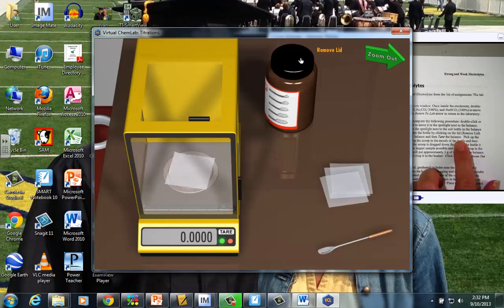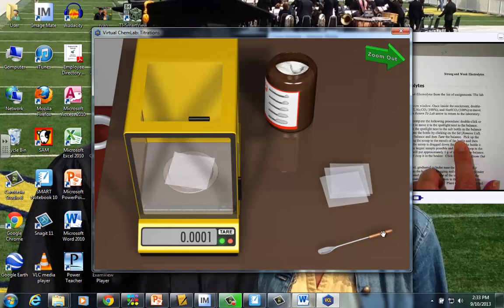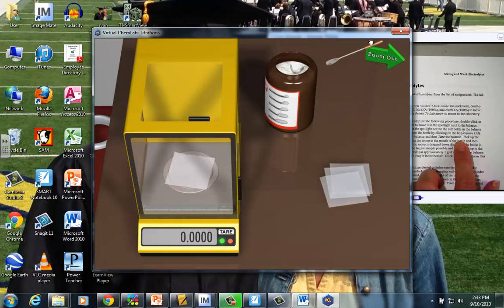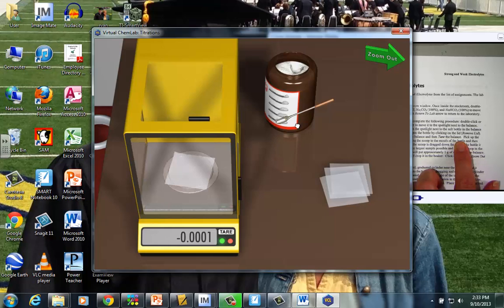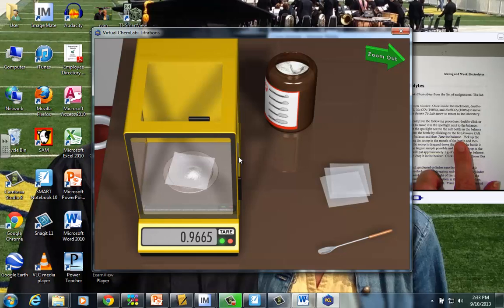If I put the cursor up here, I can remove the lid. And this might be the trickiest part, is grabbing the scoop, and just bringing it down the front of the jar to gather the contents there. Alrighty, so here I've got about a gram, and I just click and drag and let it go. So about a gram sitting on the scale.